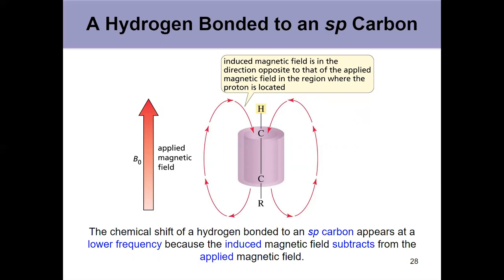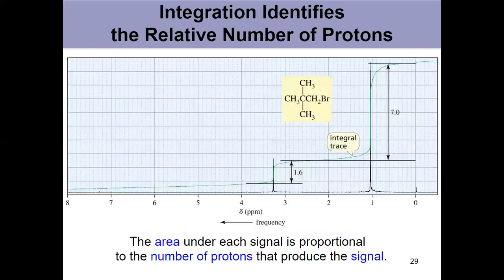So that's some on the position, right? The frequency, the ppm values at which these peaks show up. And that explains some of what we saw in the table, 14.1, in the chart that followed it. Okay? One important piece of information that we'll continue to talk about. But another thing that we haven't mentioned so far is the size of the peak.